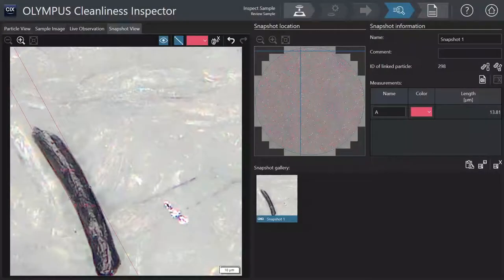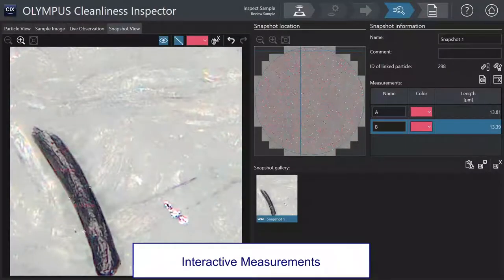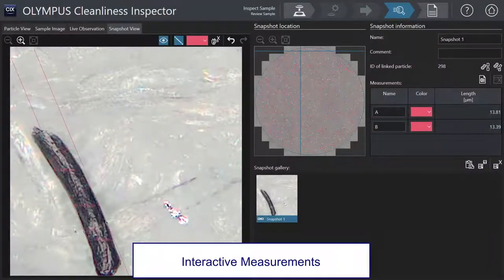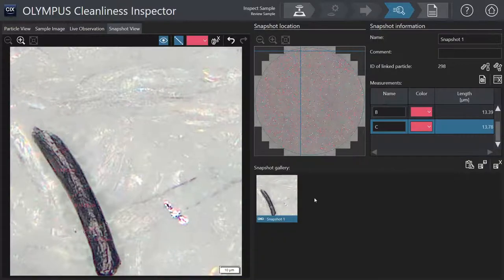For further inspection, particles can be analyzed in more detail using interactive measurements or analysis of its parameters.